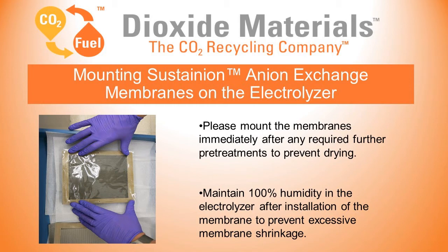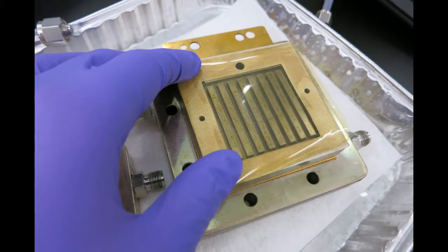Our membranes are ready. Now we're ready to mount. Please mount the membranes immediately after any required pre-treatments to prevent drying and maintain 100% humidity in the electrolyzer after installation. You want to do that to prevent excessive shrinkage.